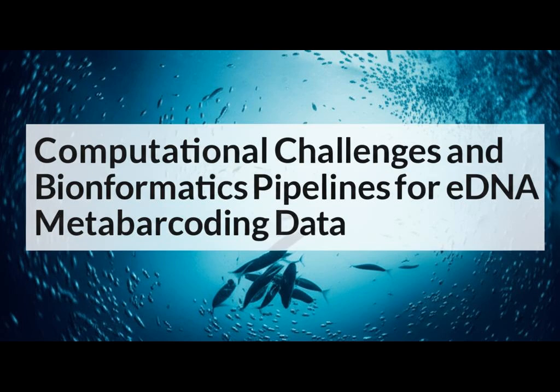First, raw sequencing data needs cleaning. We merge reads, sort them by sample, and trim away extra bits like adapters and primers. This is data pre-processing. Next comes quality filtering, where we discard low-quality or incorrectly sized sequences to ensure accuracy.